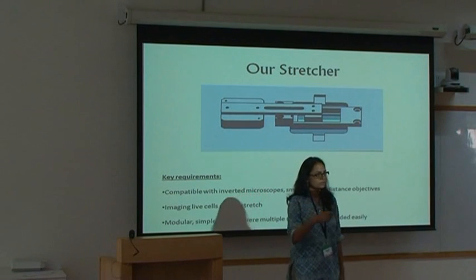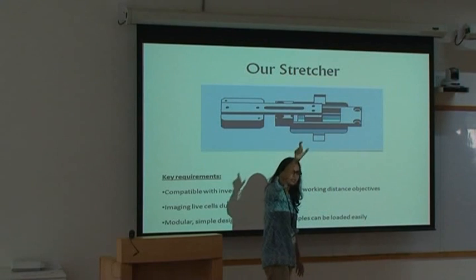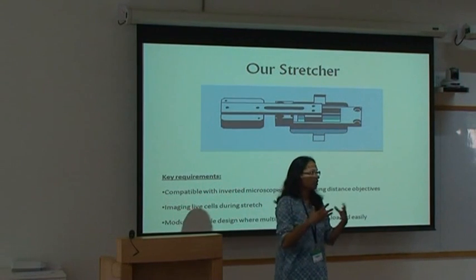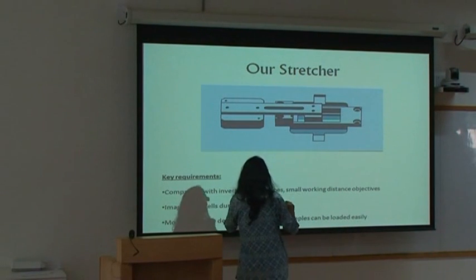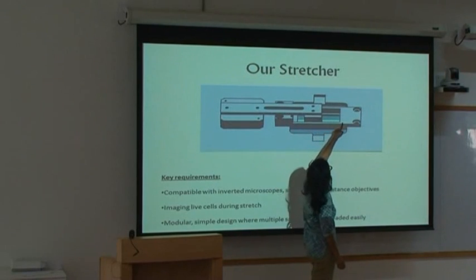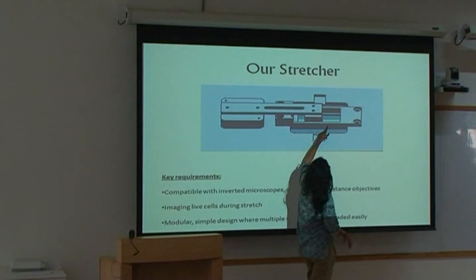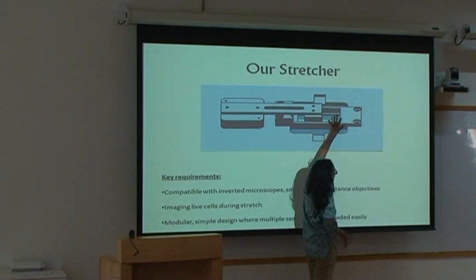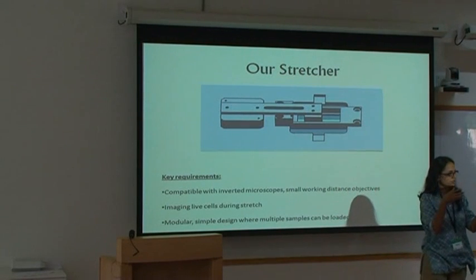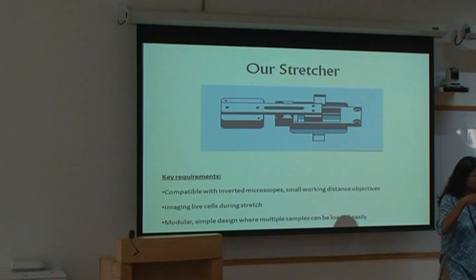You grow your cells in it. We can talk about that in a while. And then that's when you put it in the incubator in a moisture box, which is inside the incubator, which stops evaporation. Let us talk about the length scale a bit here. This is actually 1 centimeter. This is therefore around 4 or 5 centimeters, or less. So you start with something which is 0.9 centimeter long, 0.5 centimeter wide. You pre-stretch it so that it becomes 1 centimeter long.